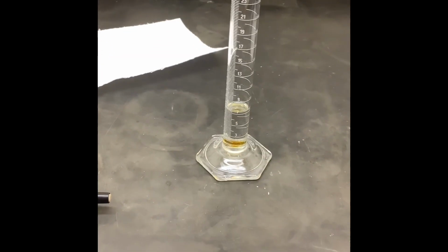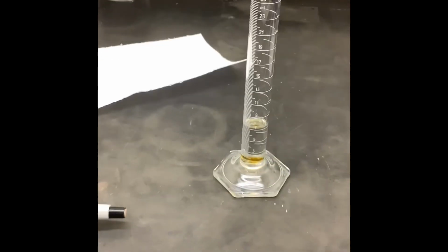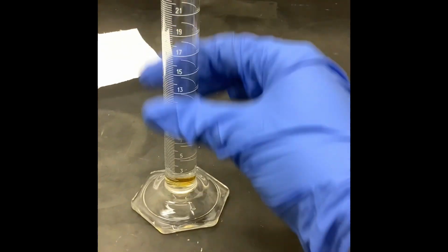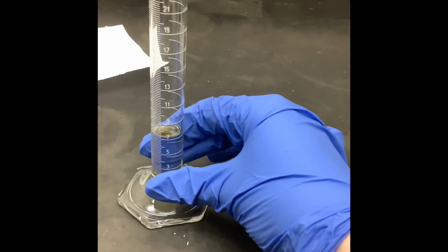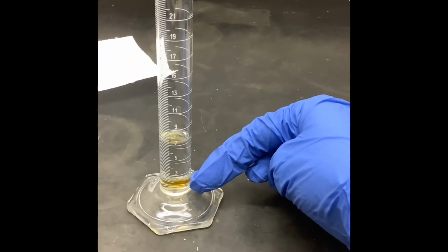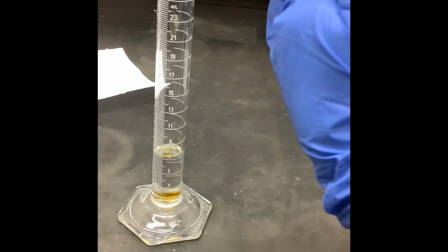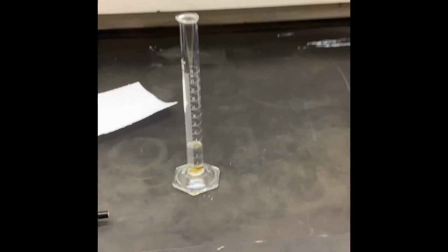I went ahead and mixed the acetolysis mixture while my samples were in the centrifuge. And I have a little cheat sheet on how much of each chemical to use. But you're going to measure those out in a graduated cylinder. The tube after both chemicals are in there is going to be a little hot. You might see some discoloration. That's normal. A note with the sulfuric acid, when you are pipetting that, pipette it very slowly when you're adding it. You just want to reduce the chance of spilling those because that's dangerous and a big headache.